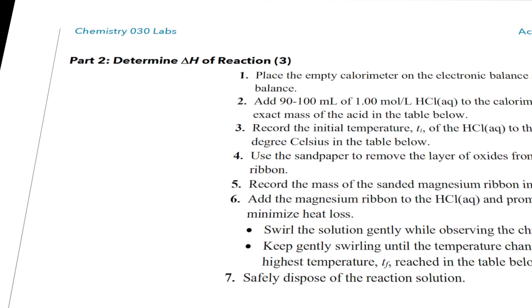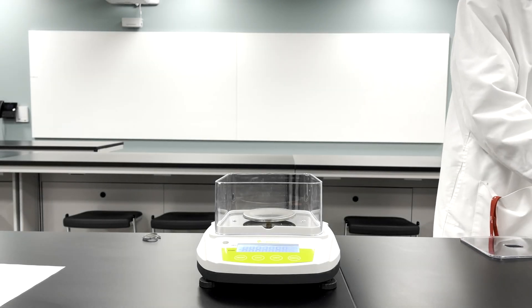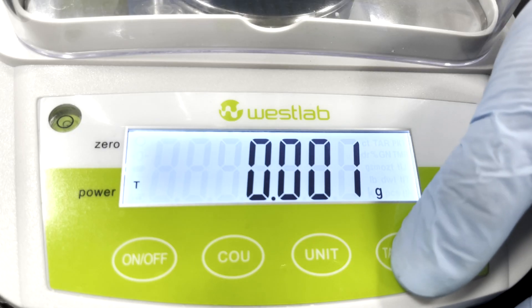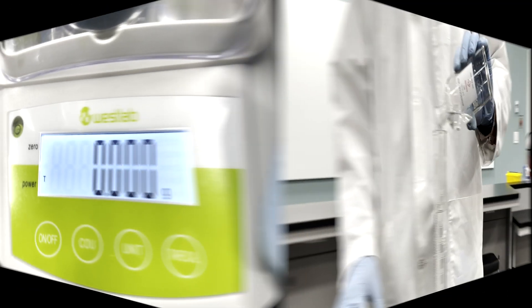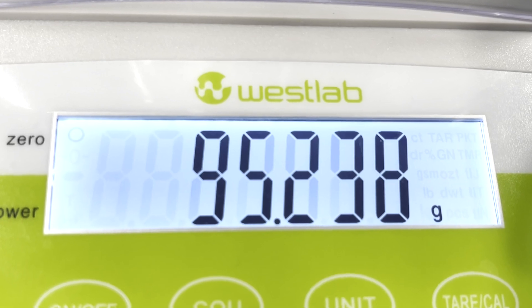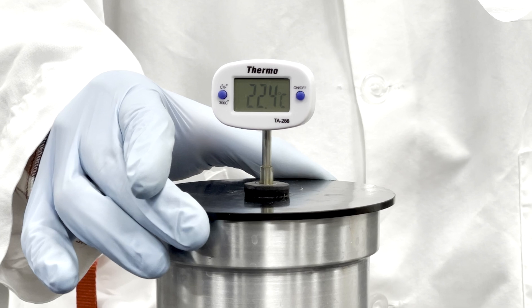In Part 2 of this lab, we shall determine the enthalpy change for reaction 3. The first few steps are as before: the empty calorimeter is placed on the electronic balance and we zero the balance. 90 to 100 milliliters of acid is added to the calorimeter, and the mass is recorded in the data table along with the initial temperature.